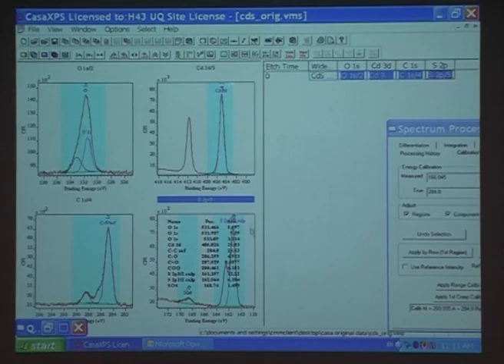So now we're getting the numbers. Now I know we've got sulfate there, about 1.5 atoms. So I'm looking for an oxygen that might be 4 times that. So it'll have to be 6. I come up here and say, well, this one's pretty close.